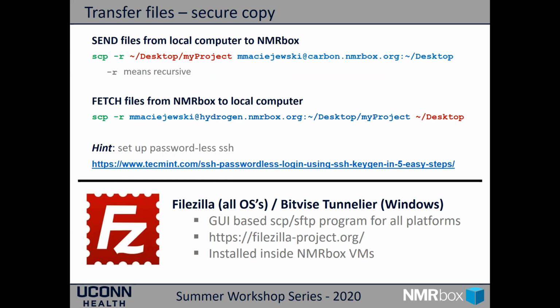Transferring files. If you're going to use NMRbox, you're going to have to move files into your NMRbox account and then back out. There are a variety of ways this could be done. I'm just going to talk about them. Users have to figure out what is the best method for them, and it really depends on what platform they're coming from and what their skill levels are.